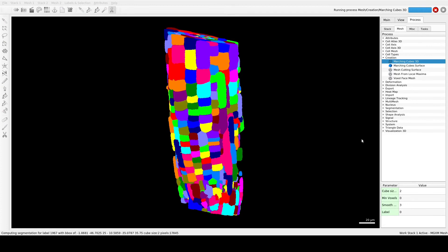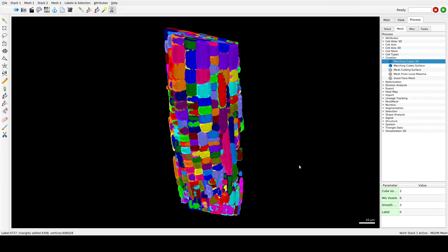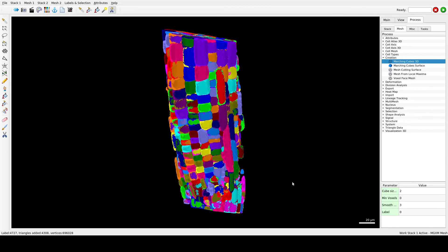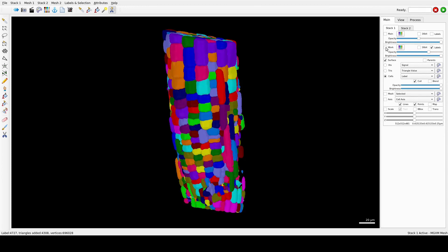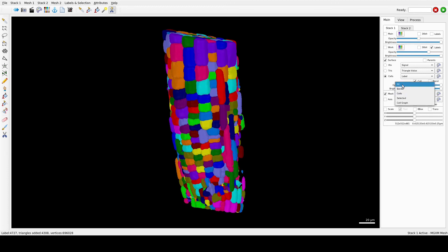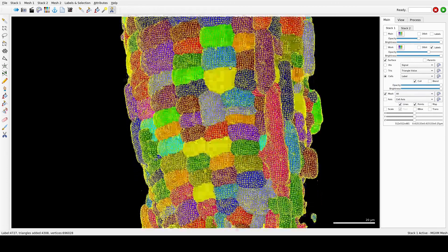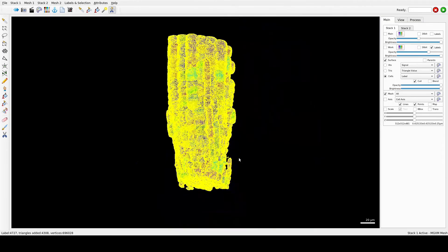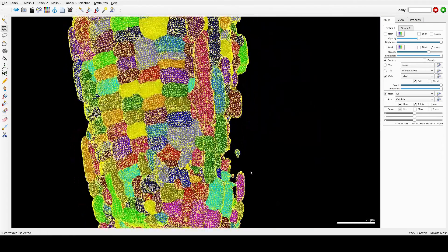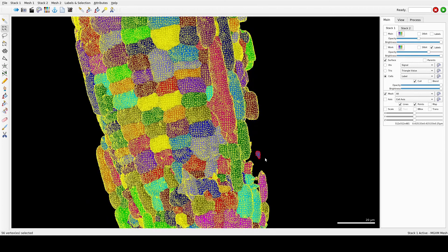The cells are automatically labeled with the same values as the stack labels. Once the mesh is extracted, you can edit each cell individually using the Select Connected Area tool. Now this is done — we can untick Work and see the mesh with all the cells segmented. If there are extra fragments visible, you can easily delete them.